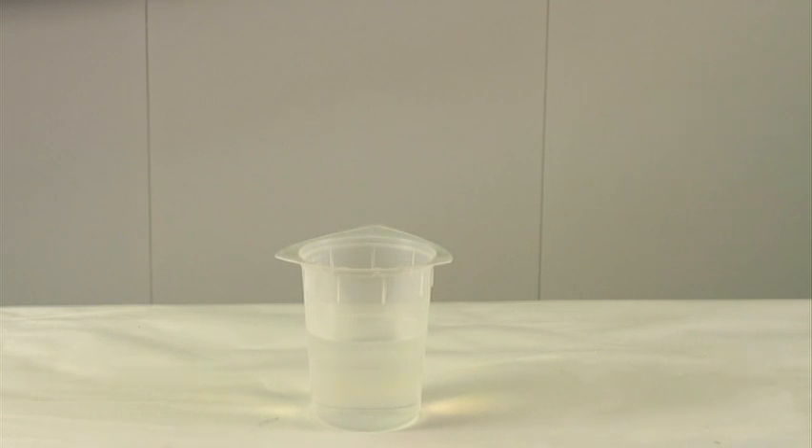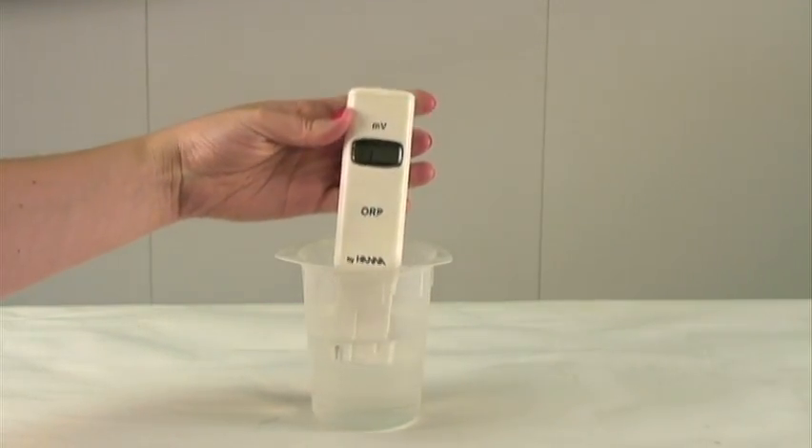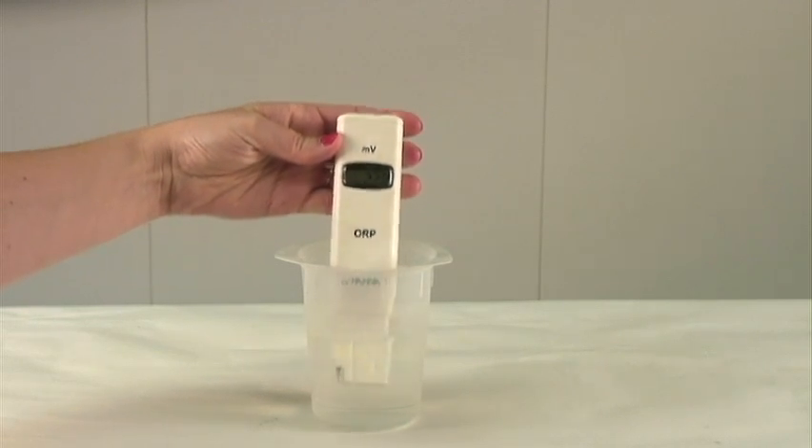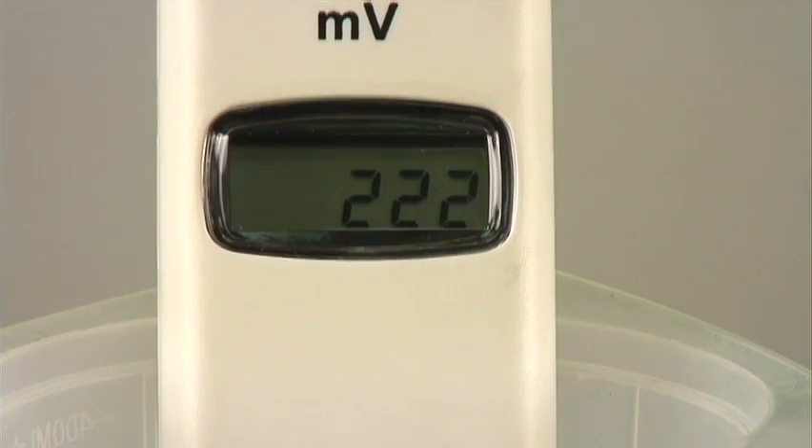The meter is factory calibrated, so there is no need to calibrate before taking your measurement. You would take your meter, submerge it in the solution to be tested, and gently stir. Once the millivolt reading stops moving and stabilizes, your measurement is finished.